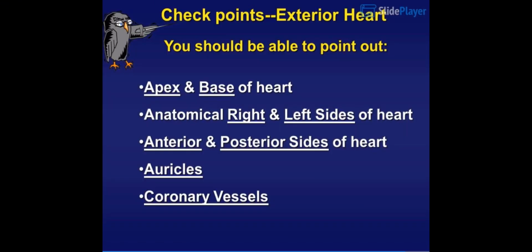Checkpoints. Exterior heart. You should be able to point out apex and base of heart. Anatomical right and left sides of heart. Anterior and posterior sides of heart. Auricles.